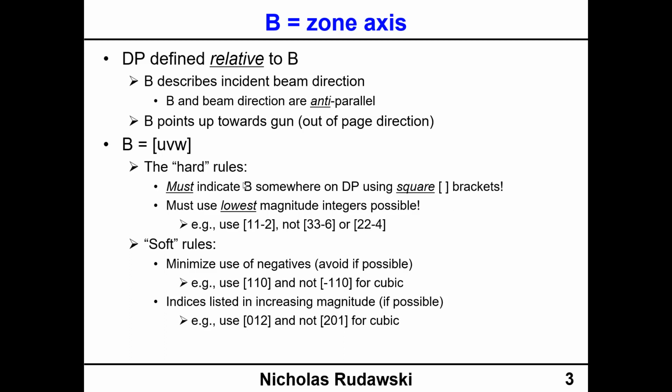So, and we'll get into all of this here. We're going to do a bunch of examples here, so hopefully we'll give you plenty to chew on, okay? All right, so now what I mentioned was that all we need to do is compute the relative G vector lengths, okay? Because we are assuming we already know the structure, okay?